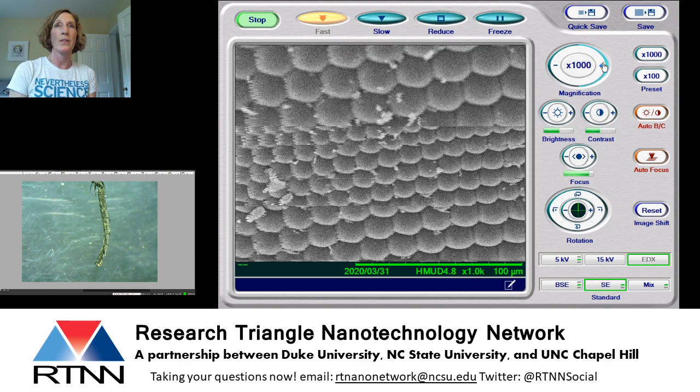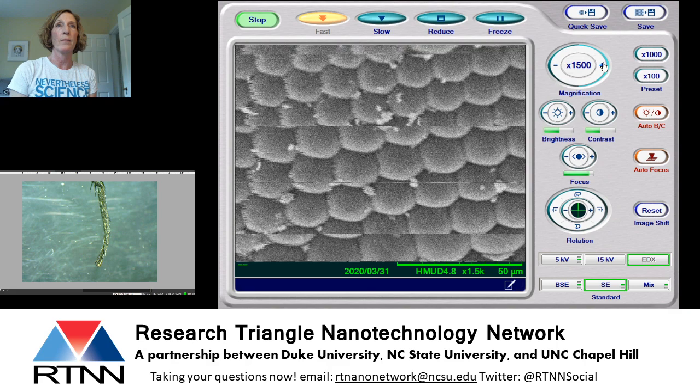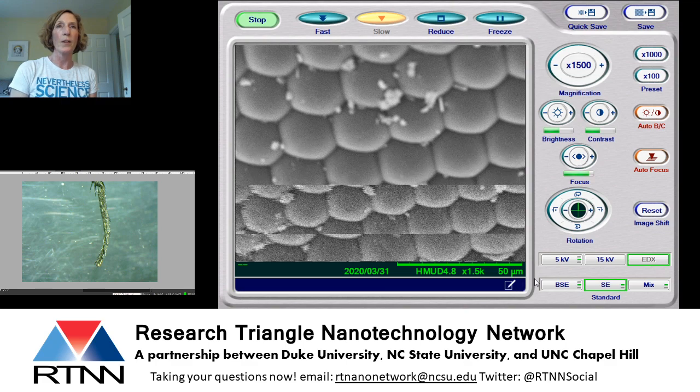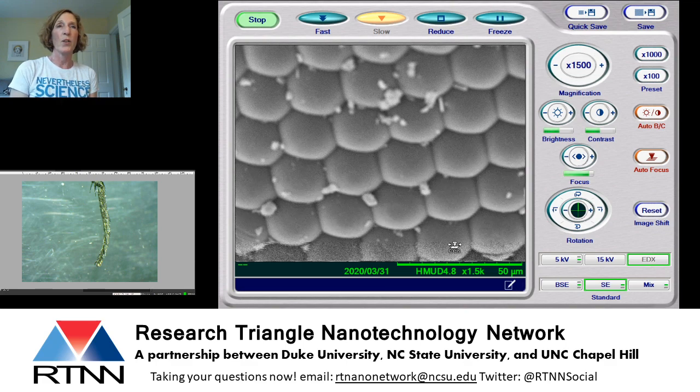So let's zoom in just a little further so we can see just how beautiful and perfect each one of these lenses is. I think this is just amazing. Let's slow that down a little bit so we have a nice sharp picture. Look at that. You can see there's some dirt sitting on the eye. Probably if it was alive, it would have cleaned that dirt off.